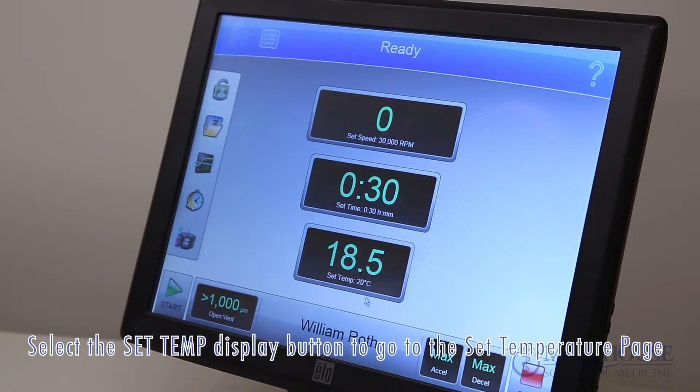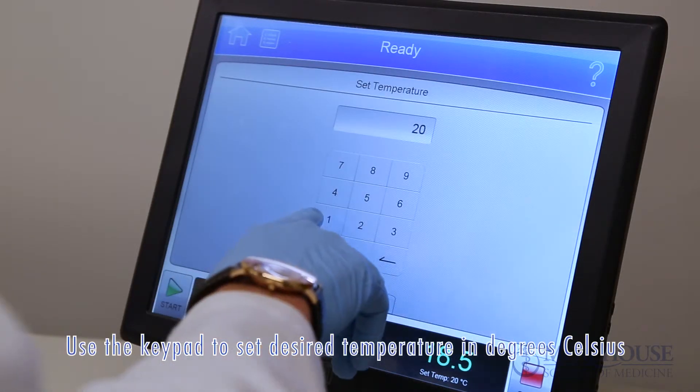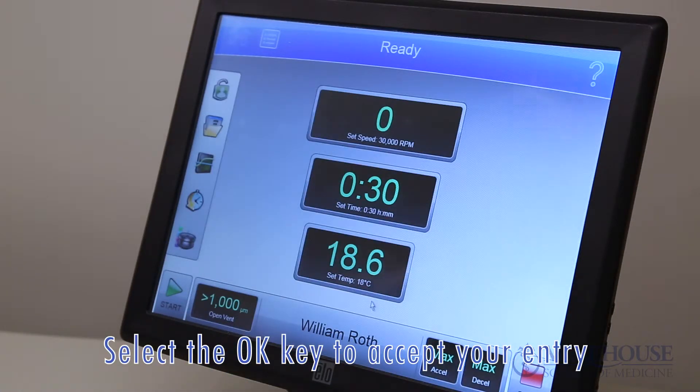Select the set temp display button to go to the set temperature page. Use the keypad to set the desired temperature in degrees Celsius, then select the OK key to accept your entry.